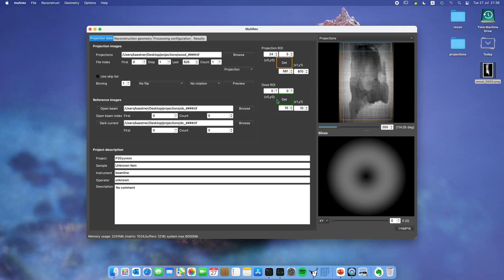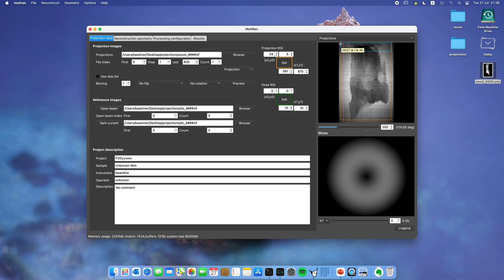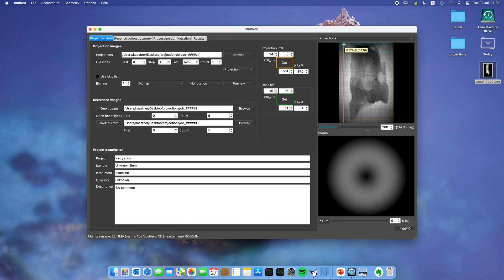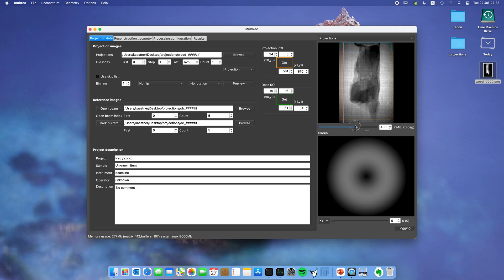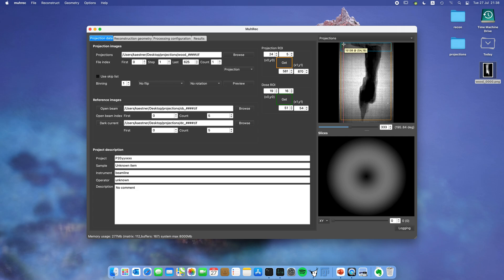The next one is the dose region of interest. Particularly for spallation sources you can have very much fluctuations in the intensity. This can be corrected by marking a little region up here in the corner. Important for the dose region is that the sample is never allowed to touch it, and you can verify it by sliding. It looks pretty good in this place.